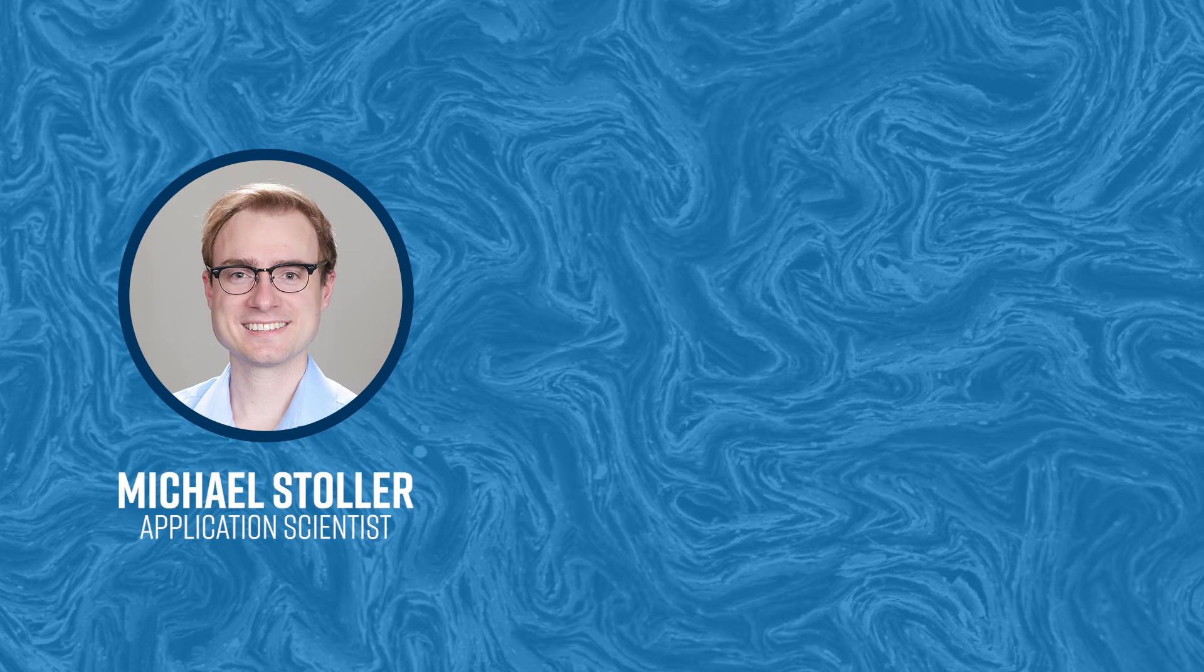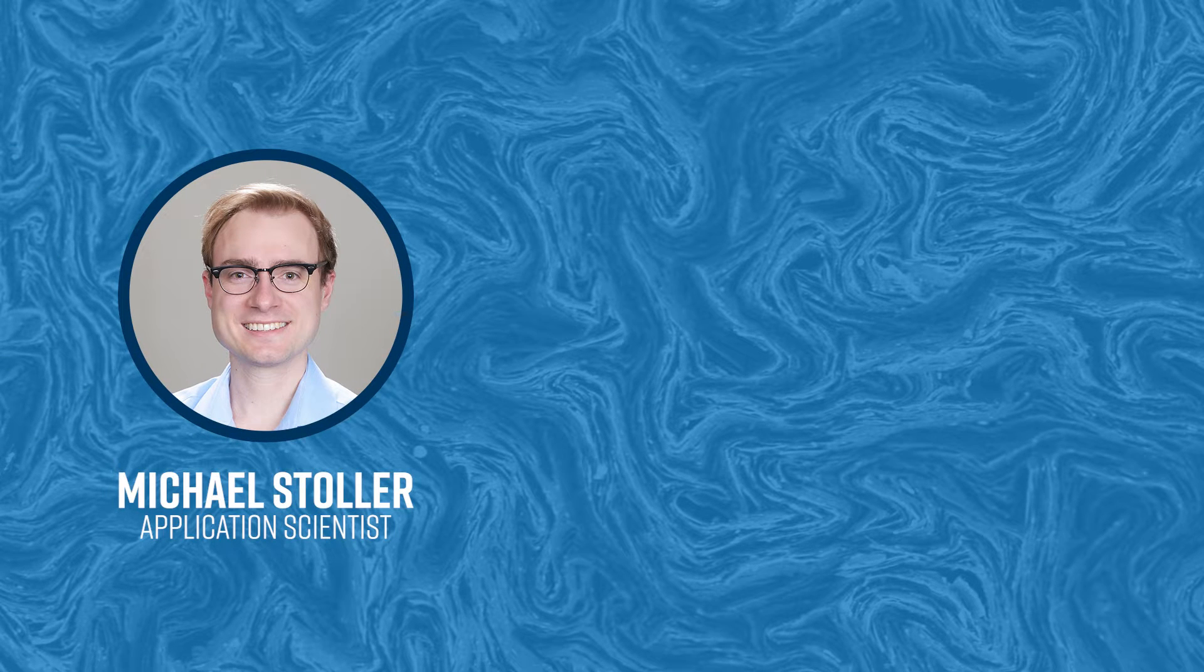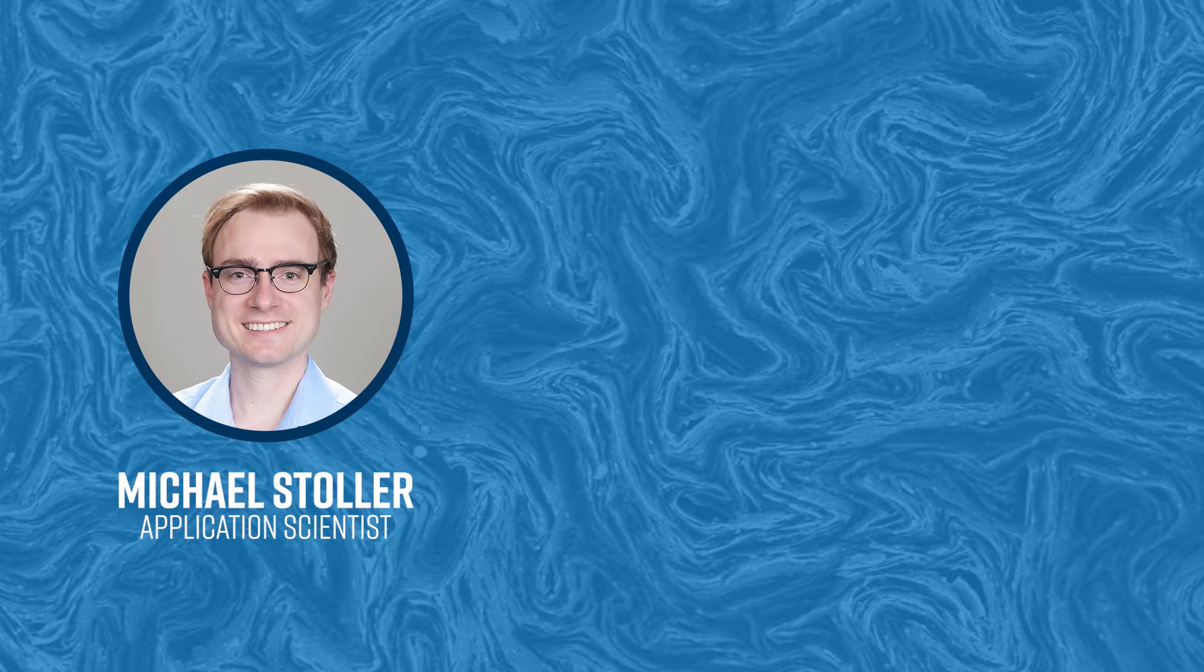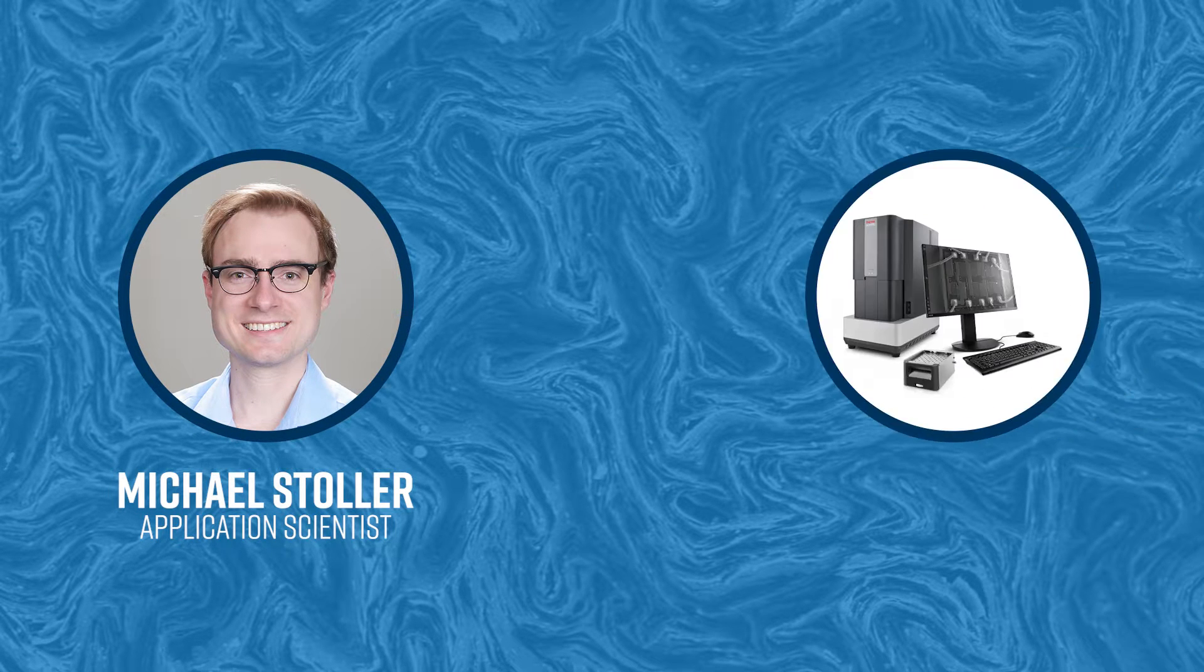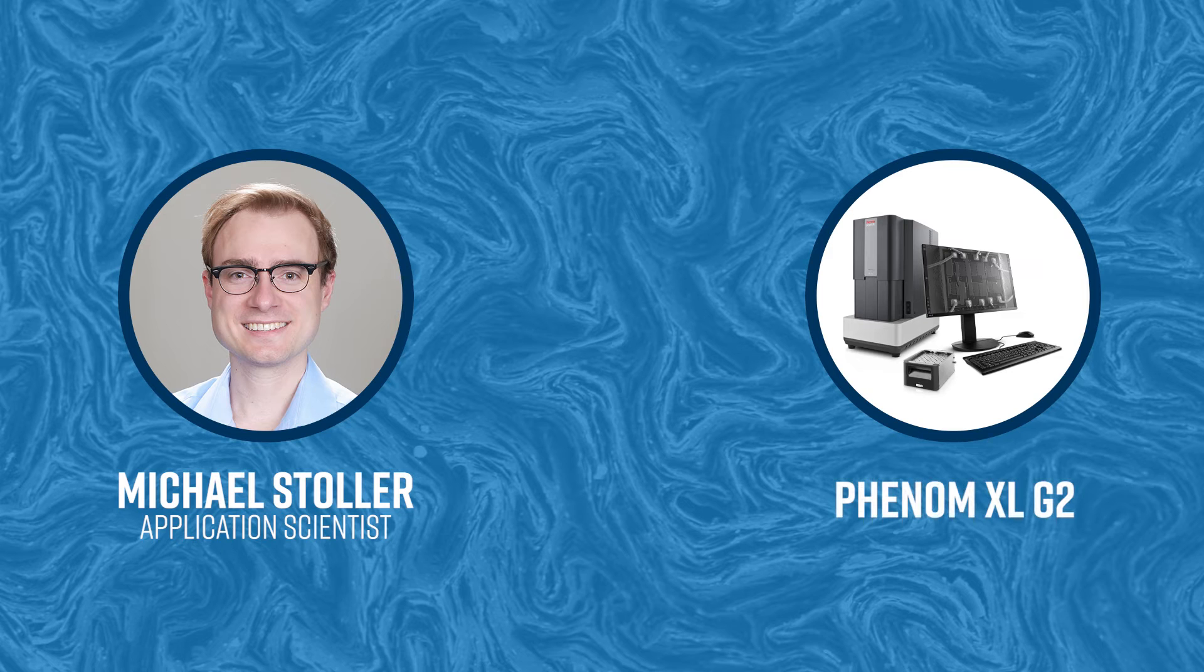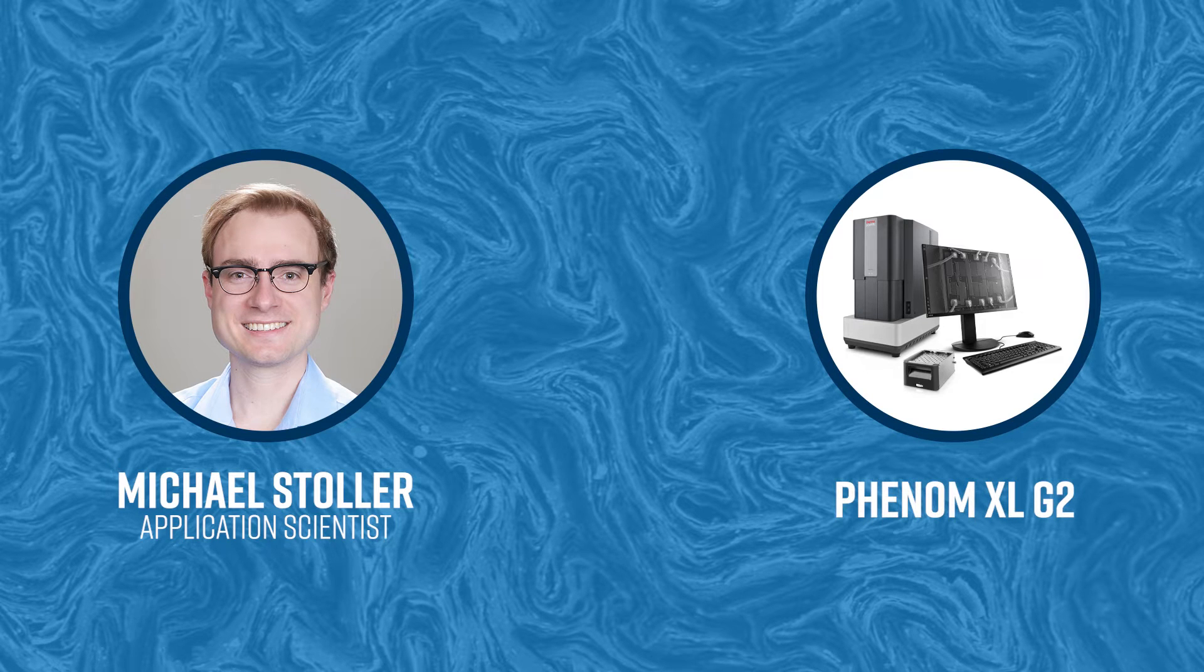Hello my name is Michael Stoller and today I'm going to demonstrate how to load a sample into a Phenom desktop SEM.